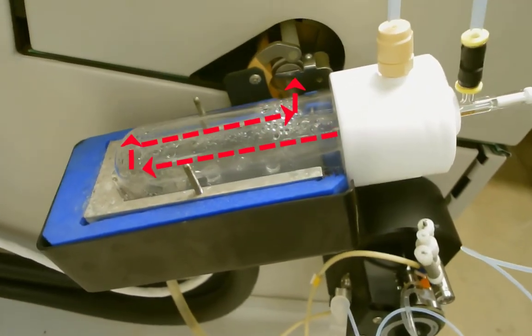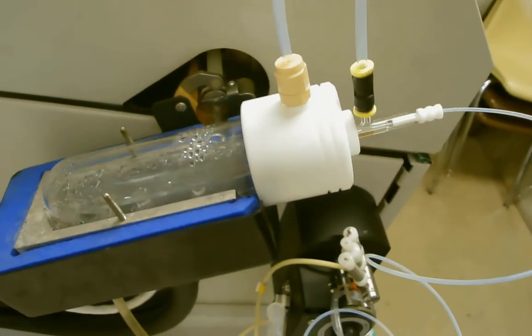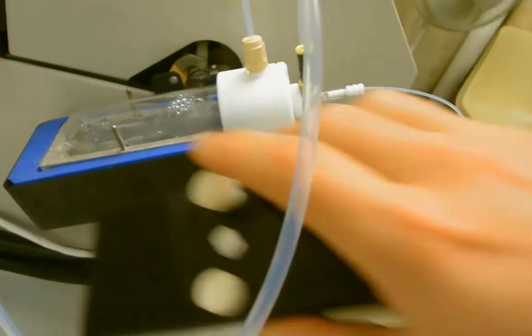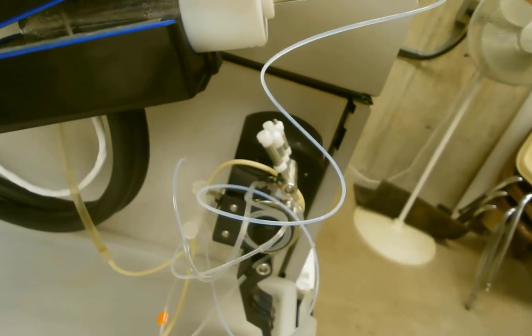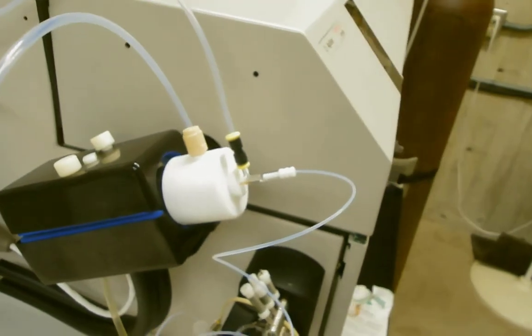So the spray chamber has a long path for the liquid droplets to flow before they go towards the plasma. And the spray chamber is cooled down to promote condensation of larger droplets so that they won't make it into the plasma, where they could cool it down and cause incomplete ionization.